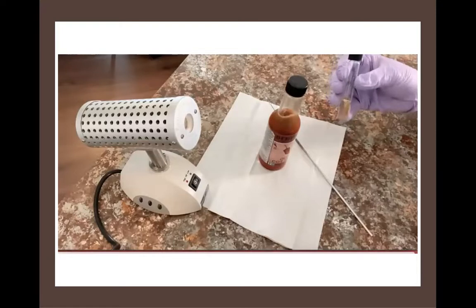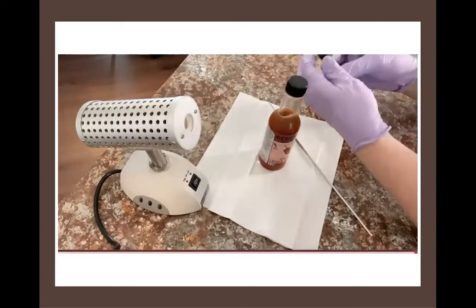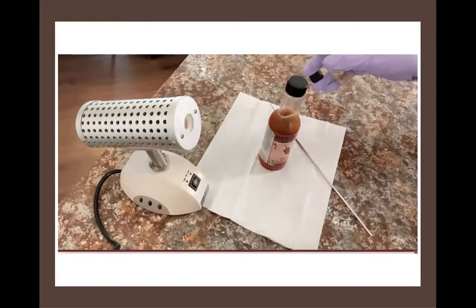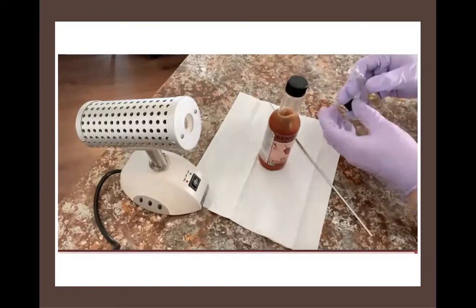So you'll notice that I'm going to take the cap off. I'm going to hold the tube at an angle, just like always. But here's the extra step. I'm going to pass the neck of that tube, the mouth of that tube, through that flame.